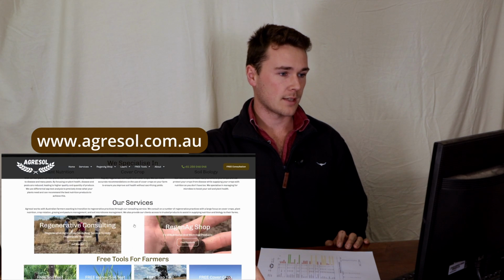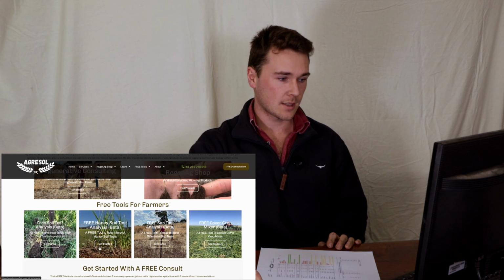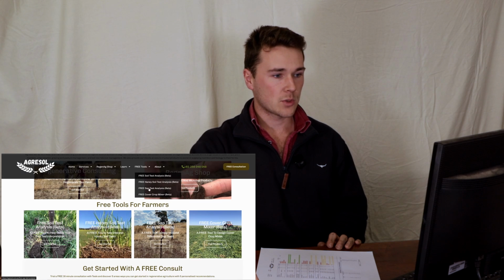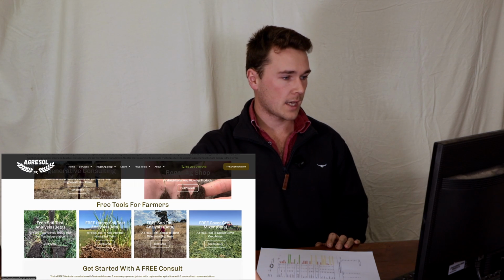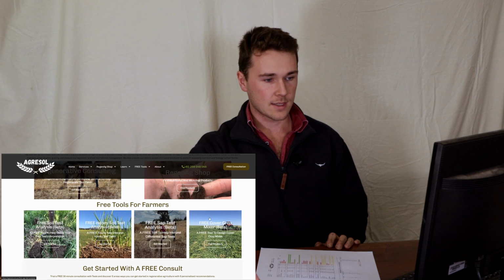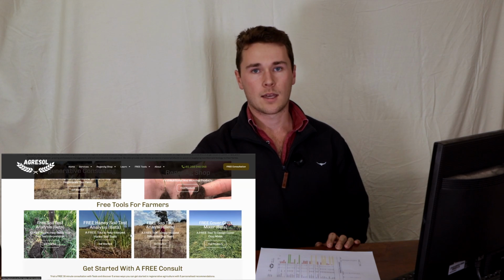So if you head to agresol.com.au, you can scroll down to free tools for farmers. What you'll find there is a free Haney soil test analysis. You can either get started there, or you could also go up to our free tools for farmers, and there's our free Haney soil test analysis there. We also have our soil test analysis, which is of our Agresol. We also have our sap test analysis and our cover crop mixer. But anyways, if you click on the Haney soil test analysis, it'll take you to the next page.